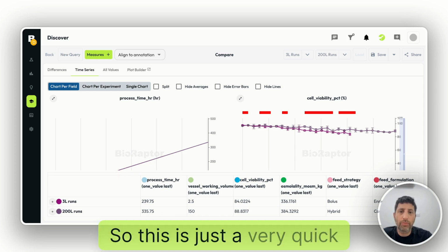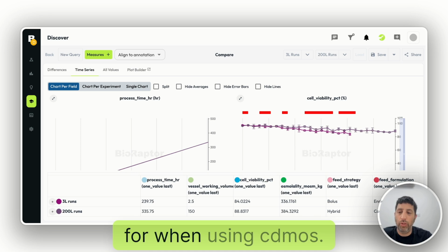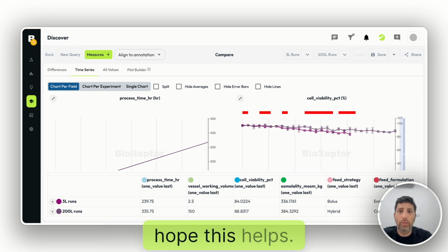So this is just a very quick tour of the system for when using CDMOs. Hope this helps. Thanks.